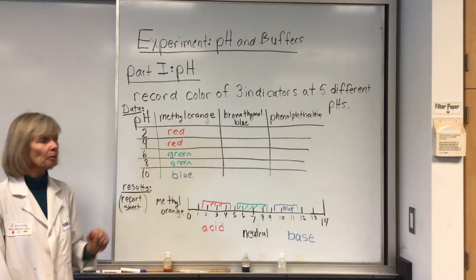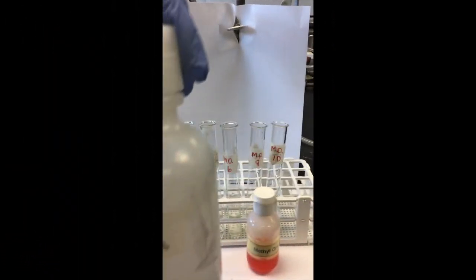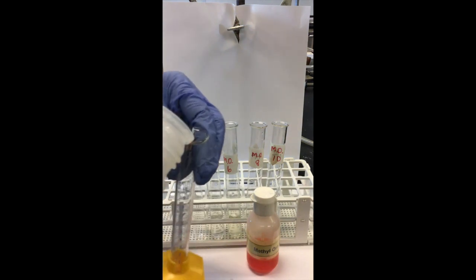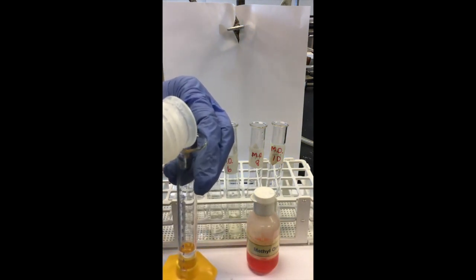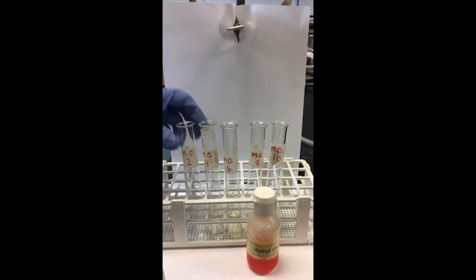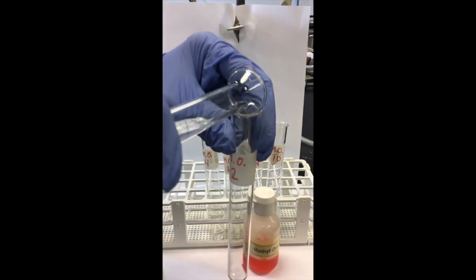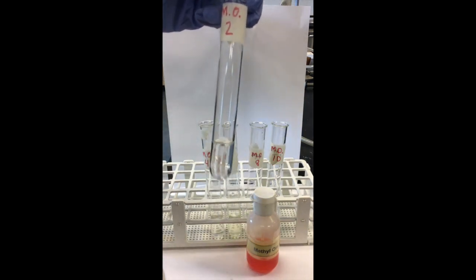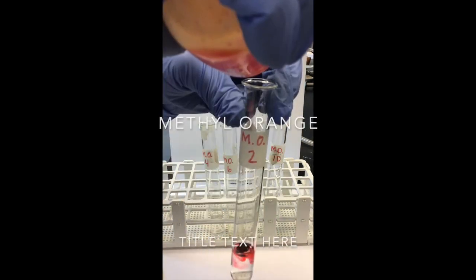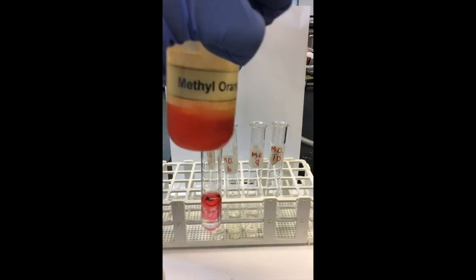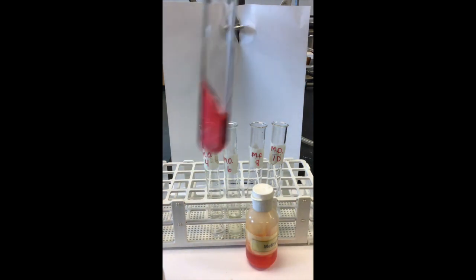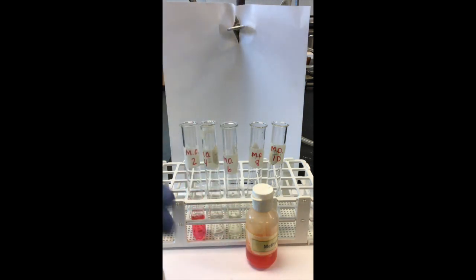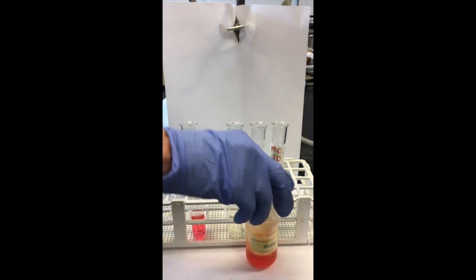Now let's look at the actual pHs of the solutions to get the true colors. I'm going to measure out 5 milliliters of my solution at pH 2 using my small graduated cylinder — approximately 5 mL; they don't have to be exact but should be close to the same for all of them. I'm going to add 2 drops of methyl orange, swirl the solution, and then record the color at pH 2. The other solutions I've already measured out the 5 mL, so all I need to do is add 2 drops of indicator to each one.